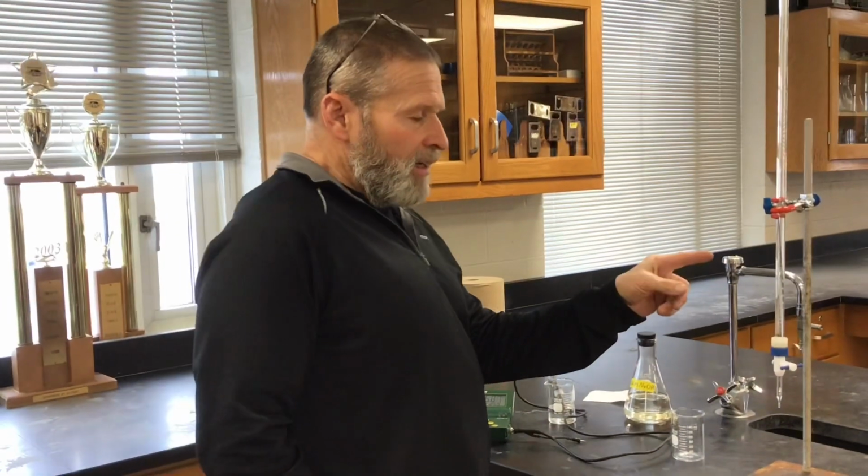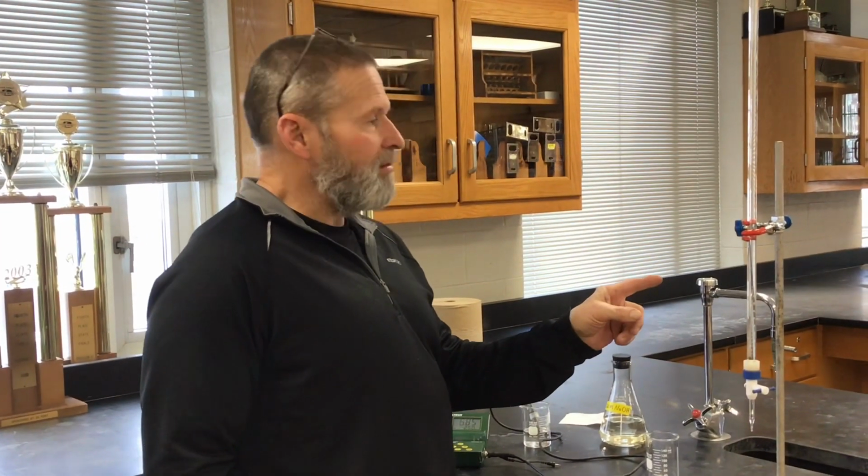Okay, so for part one of this lab, we're titrating a strong acid with this standardized NaOH. Your goal is to use the data to create a titration curve, use the titration curve then to help figure out the concentration of the acid. Okay, so we've got a strong acid here.